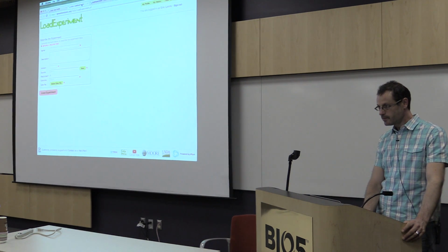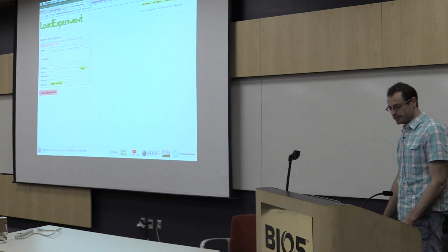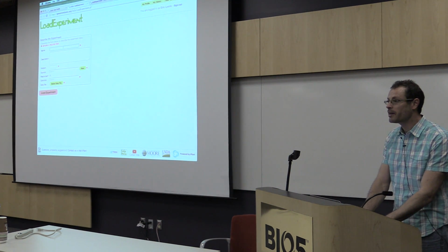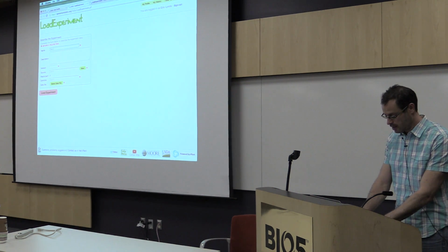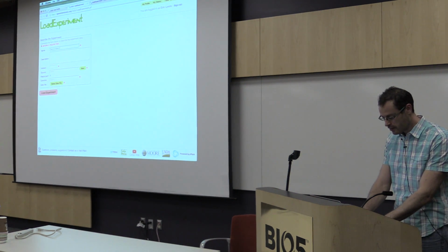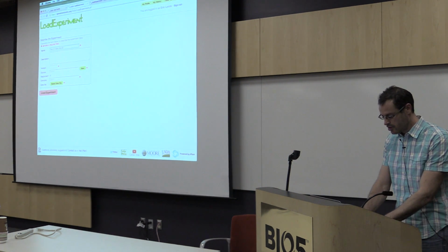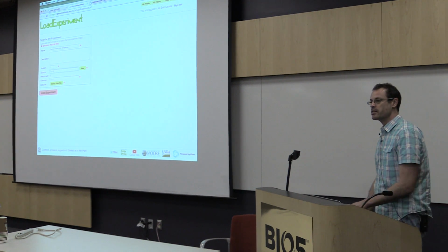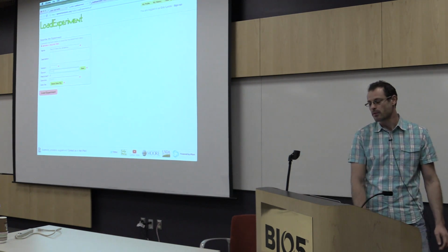So now we're going to load your experiment. Give your experiment a name. I'm going to call this one test, in class, live, dangerous, live demos. Version 1, source. Source is where you got these data. We make it a requirement that you attribute these data to somewhere, someone.